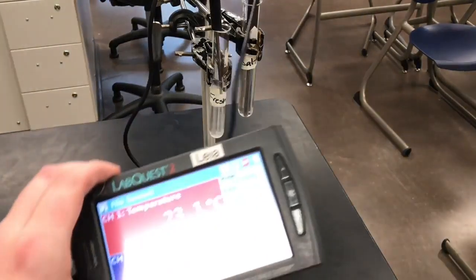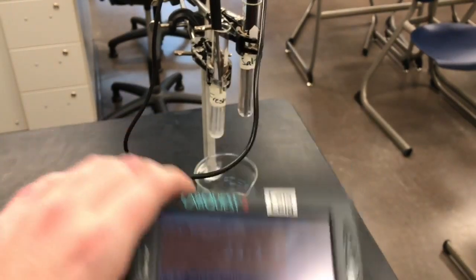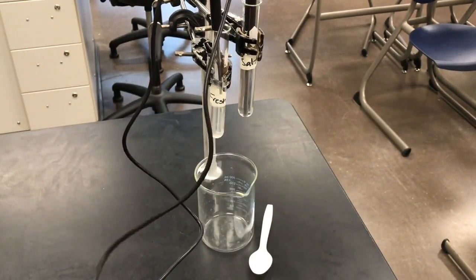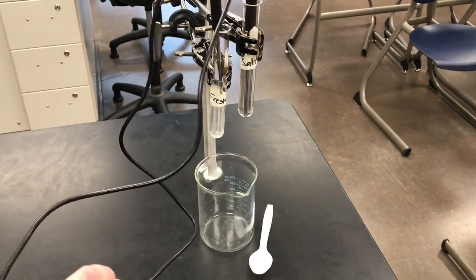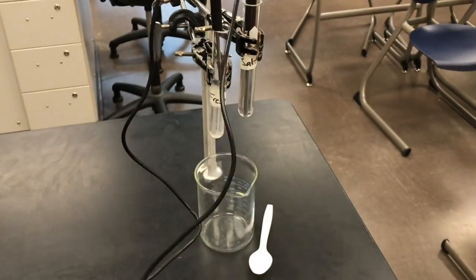I just went ahead and put in my two temperature probes here. I put the first temperature probe into the fresh water, the second temperature probe into the salt water. We're not going to hit play or do anything with this just yet.